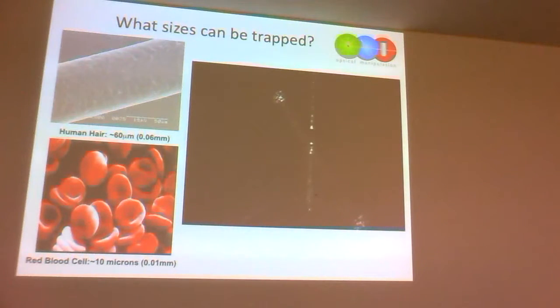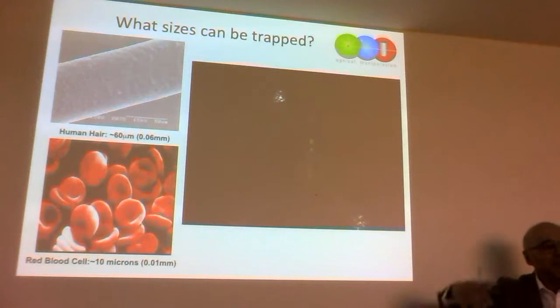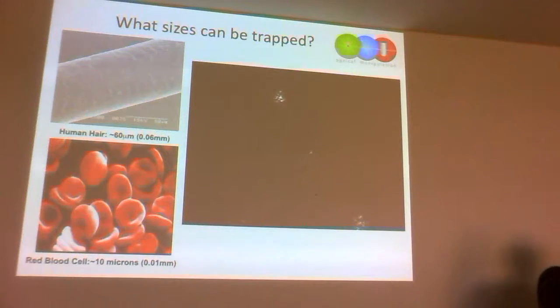Now, I'm not going to have time to tell you about resonances, which these forces also apply in the atomic regime. And this is an experiment you can do. So here, this is an experiment we did in our lab, just showing the type of thing they did in the 1960s. A laser beam goes up, lots of little droplets from a little spray or an aftershave or something come down, and every so often, a droplet stops. So that's being held by light. Okay? So that's a droplet held by light in air.